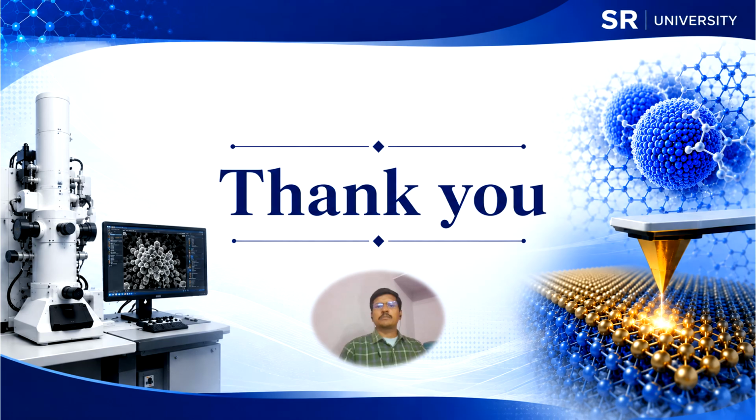Thank you for attending this module on advanced X-ray diffraction analysis. In this course, we explored the fundamentals of Bragg's diffraction, X-ray diffraction instrumentation, peak broadening analysis, crystallite size estimation, Williamson-Hall analysis, the importance of Rietveld refinement, profile and defect analysis, and advances in in situ XRD applications.